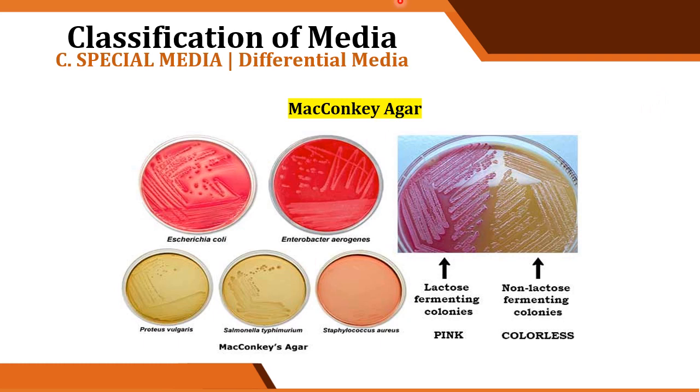Okay, so it contains peptone, meat extract, sodium chloride, bile salts, lactose, and a neutral red indicator. Okay, kaya siya naging selective kasi particularly used lang siya for enteric bacilli. Okay, so ayan, as for example, Escherichia, Enterobacter, Proteus, Salmonella, mga bacteria found in your digestive system.